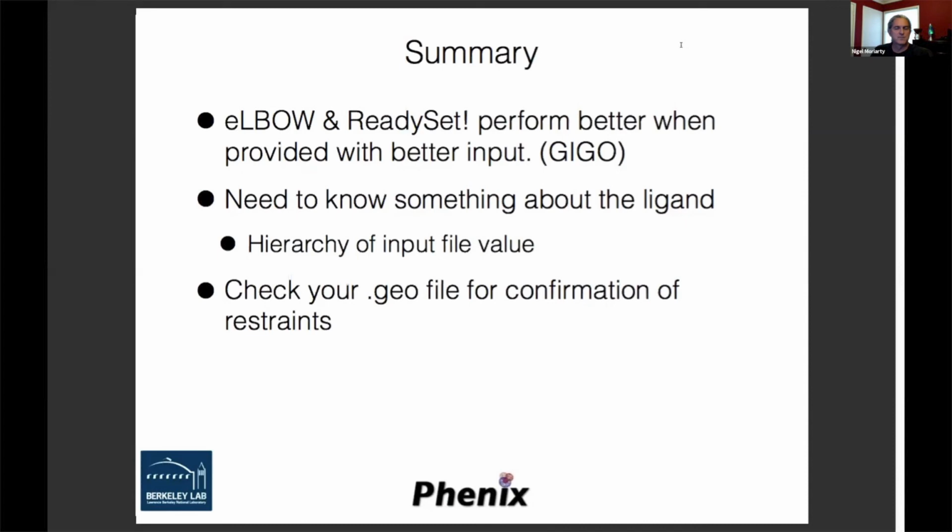So one of the cool things about Elbow is that it will interface with Mogul, which is a very nice validation package from the Cambridge database people, the small molecule database, and most of you can probably access that for free. It's very easy to get it from most universities and educational institutions. If you install that, Elbow will generate very, very nice restraints for you.